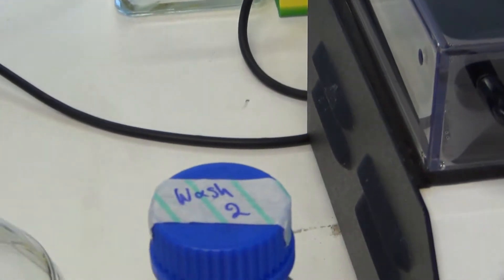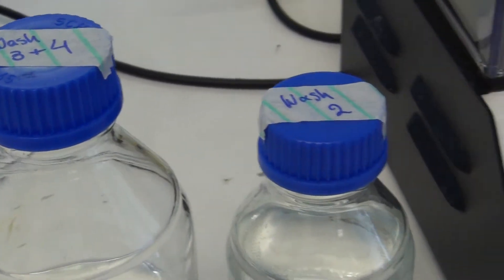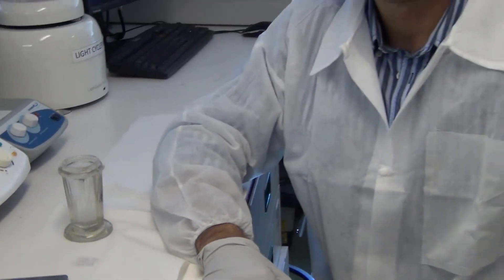After a series of washes performed according to the manufacturer's recommendations, the ArraySlide is quickly dried by centrifugation with the barcode facing down. It is important to mention that while transferring the ArraySlide from one wash to the next, the ArraySlide must not dry out. Also, this step is carried out in dim light. Thank you.